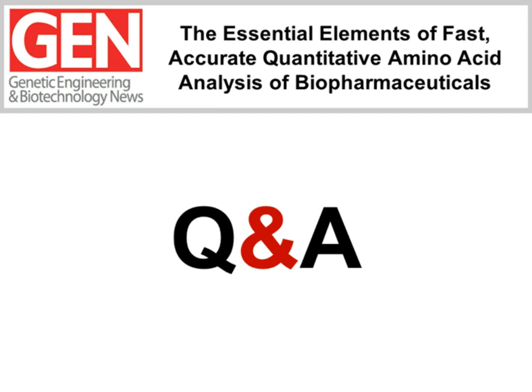And Tom, great question. What are the best practices for quantitative amino acid analysis when one's analyzing proteins?